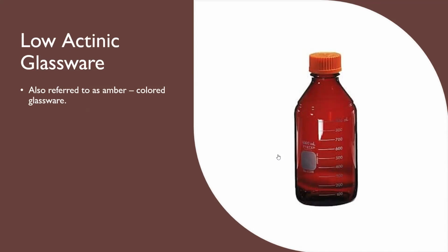I believe that once in your life you were able to use sulfuric acid in one of your experiments in your minor chemistry courses. The bottle wherein your sulfuric acid is contained is an amber bottle.